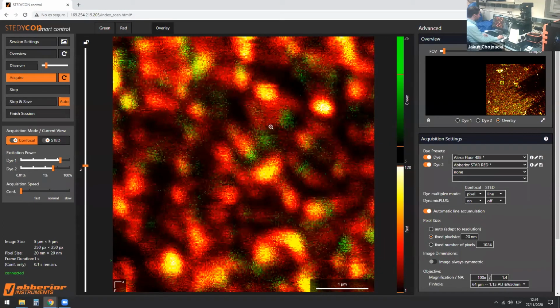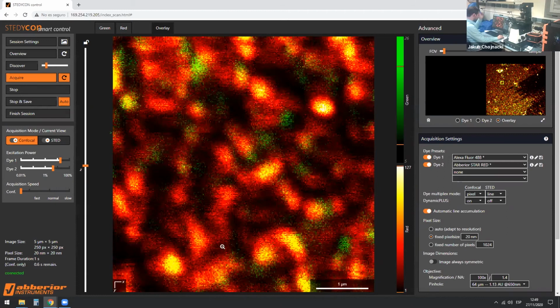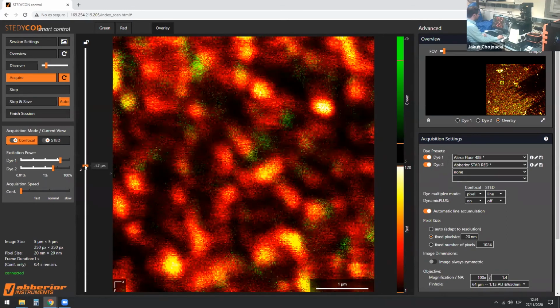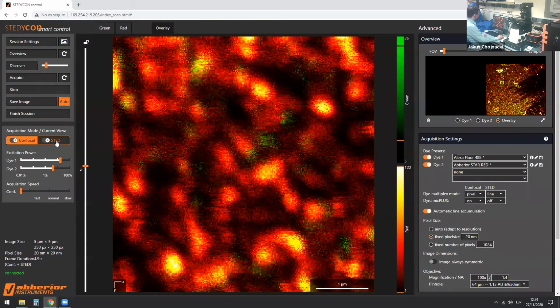Okay, so the green signal once again is the virus particles, individual virus particles, and the orange signal is all those envelope proteins that we're detecting. But there, as you can see, it's very diffuse and blobby. So let's try again to image this using super resolution microscopy.